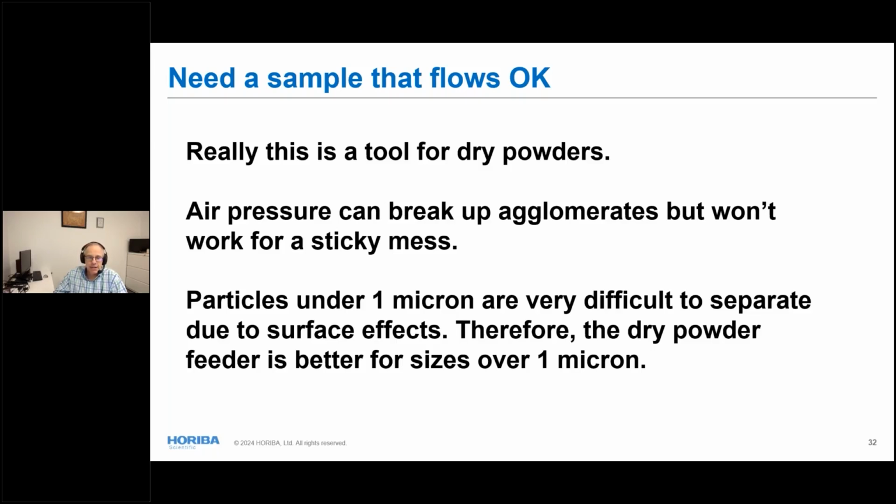The other comment is that particles under 1 micron have a relatively large surface area, and so those particles can be very difficult to separate unless you use something like a surfactant or liquid rather than just air to keep the particles apart. So I like to use that for kind of larger particle sizes.